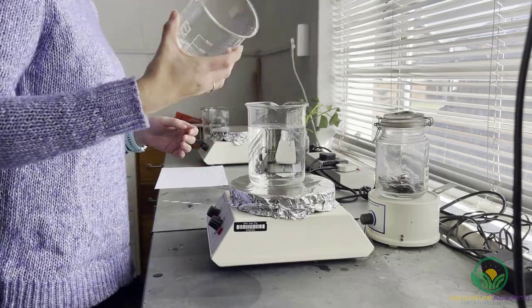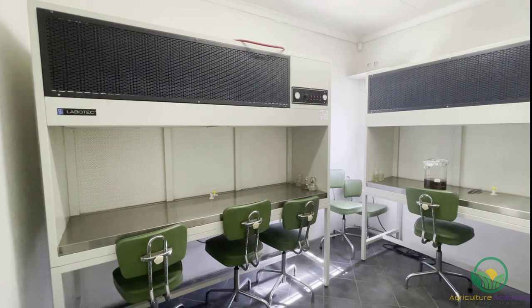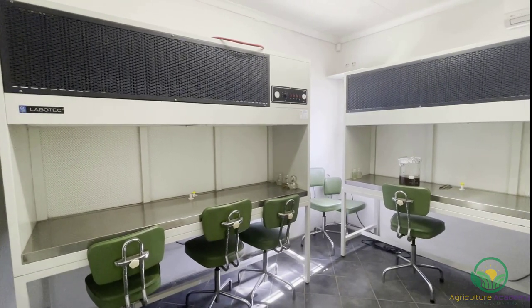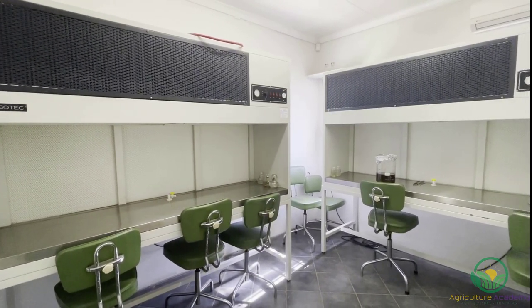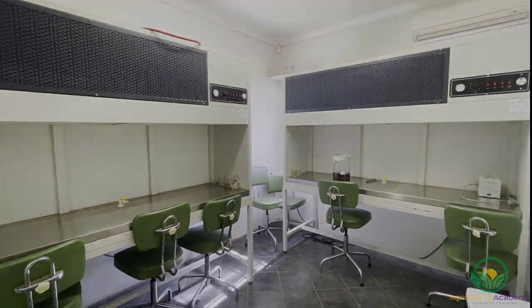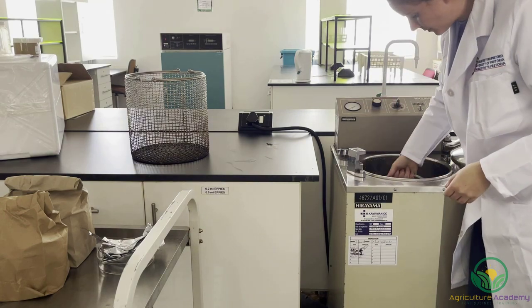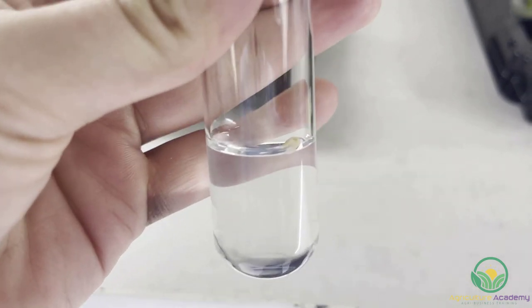To perform tissue culture, a specialized laboratory is often required. This lab requires certain equipment, including a laminar flow cabinet and an autoclave. A laminar flow cabinet exits sterile air outwards and helps to prevent contamination while explants are being placed into test tubes and growth medium. An autoclave is used to sterilize the growth medium.